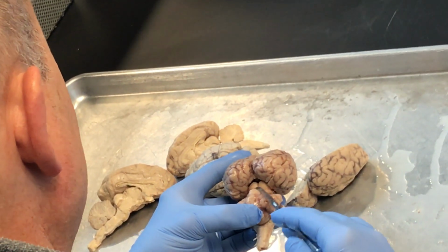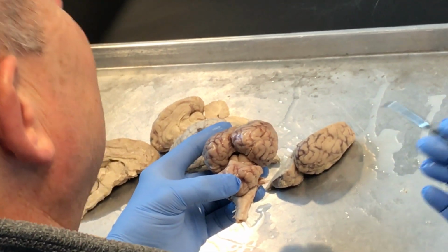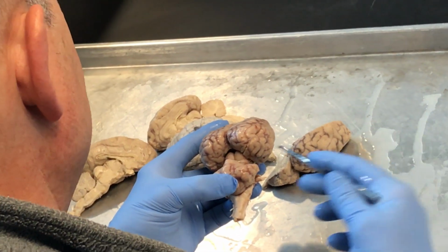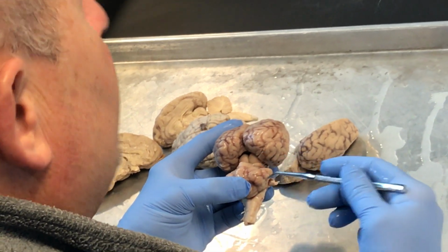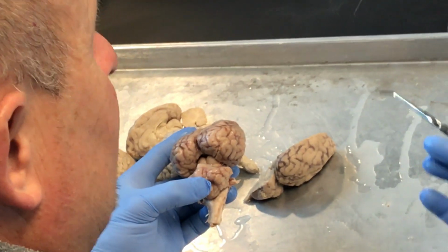By the way, these two little things are involved in automatic reflexes. And we'll talk about this in the lecture maybe another time or two. But they're part of what we call the tectospinal reflex. So I did this on Tuesday, which was Halloween, so it was perfect.